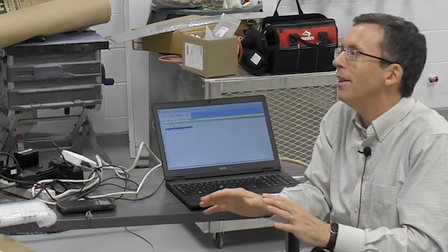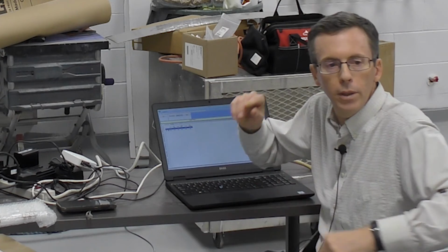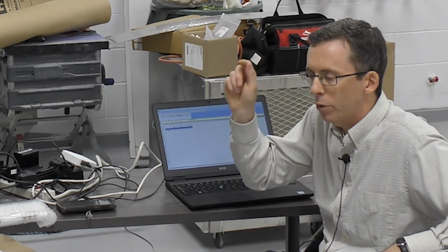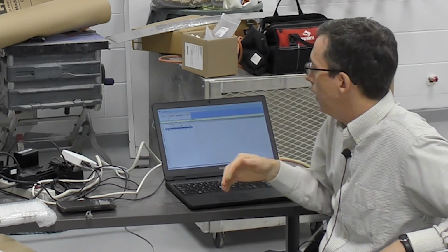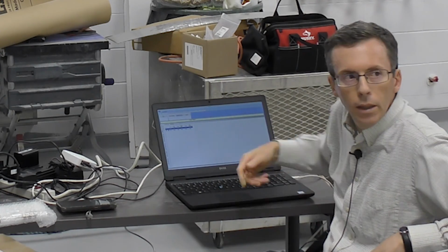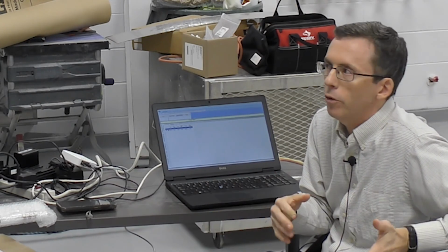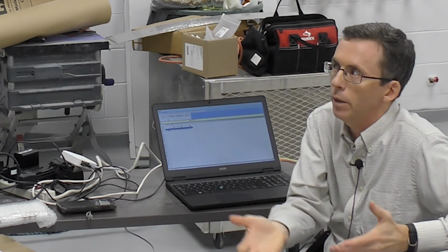And then when you're finished, you just come in. You'll see all the data up there. When you're finished, there'll be a stop. So you push stop. It will ask you, are you sure? Then you can say yes. And then you'll see at the end, and I can show you that at the end, you can take a flash drive, plug it in, and it will say backup data. You can back up the data on a flash drive. You can immediately put it on your computer. So now it's on this computer. It's also on a flash drive, which you can take to your office, stick it in, or somewhere else, so you can work on it at home. Yeah, that's the whole thing, I think.